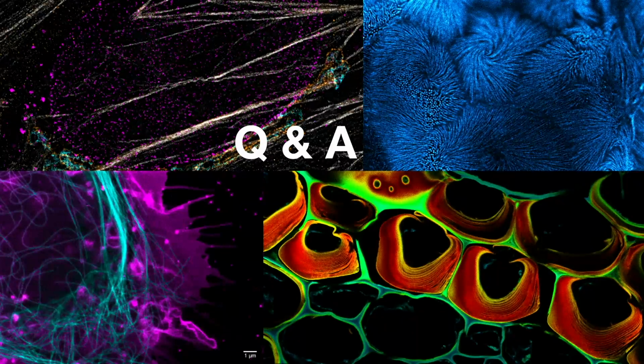One more question about the matrix detector. If people already have the matrix detector in their system and they want to start with TIMEBOW, what should they do? Well, they don't have to do anything to their hardware, because if you have a matrix detector in your microscope, you're ready for TIMEBOW and lifetime imaging. What you could do is you could just contact us for a software test. Yes, wow, these are great news.